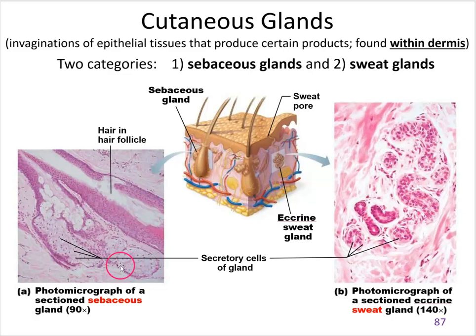And then next to it, these strange looking cells, these large cells that look kind of empty, almost like adipose cells. And then as you follow this gland and it gets closer to the hair shaft, they're not cells anymore. They have erupted, and all of the oil they made is just in a blob. The cells are dead. So you won't always find these if they're not in the plane of the slide, but we will find some of these.